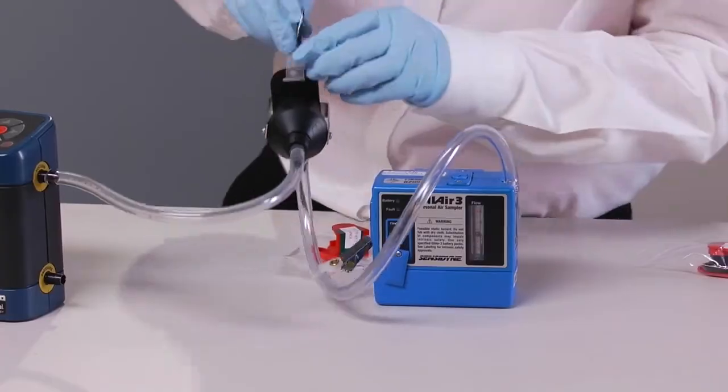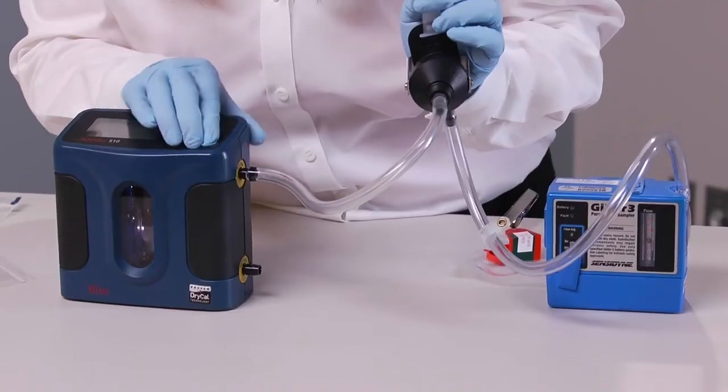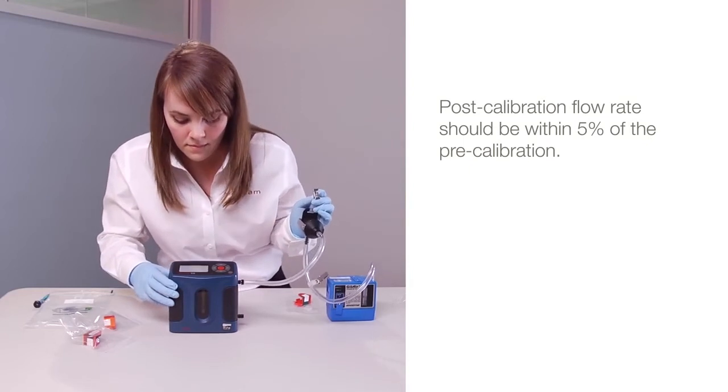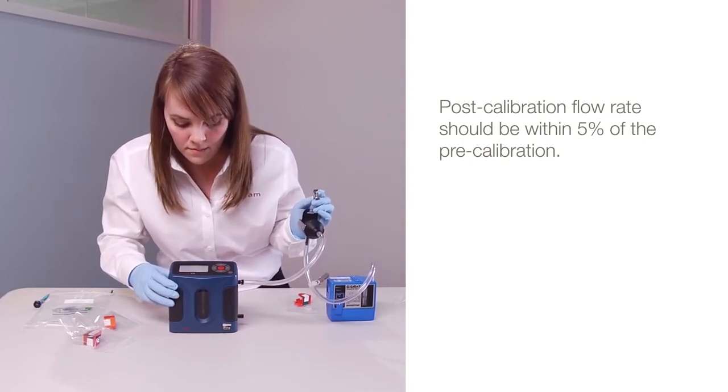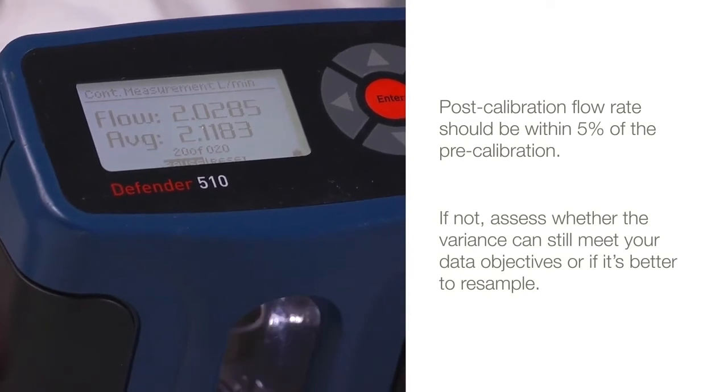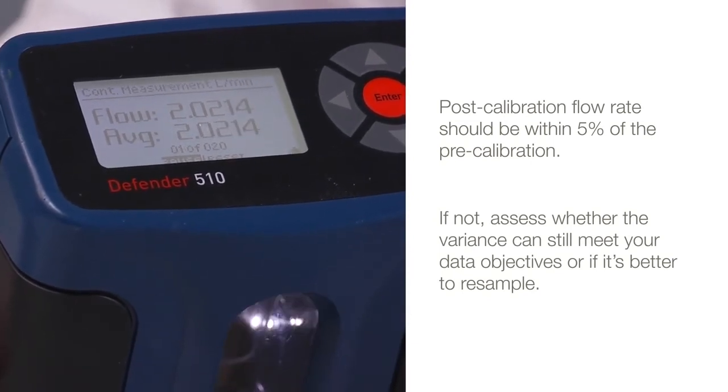To finish, use the calibration sampler and adapter to check the flow rate of the pump. The post-calibration flow rate should be within five percent of the pre-calibration. If it is not, then assess whether the variance can still meet your data objectives or if it's better to re-sample.